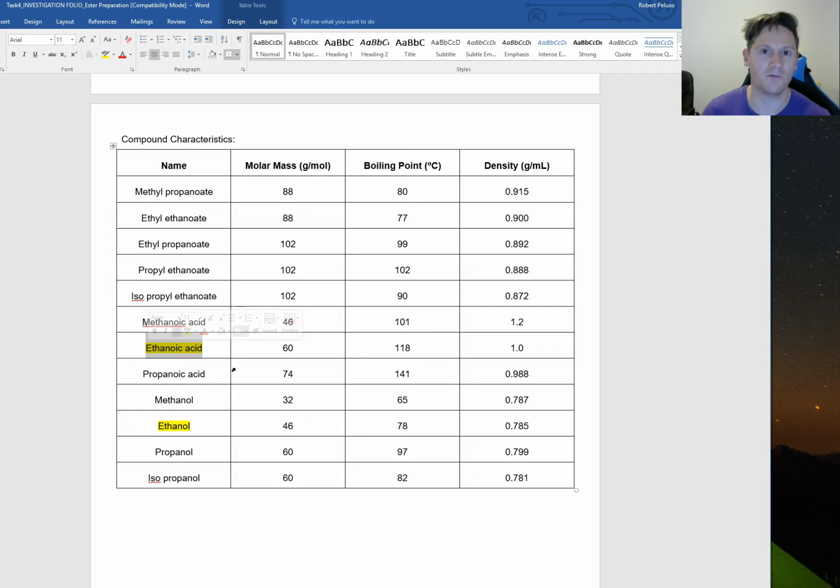So essentially, we're assuming that it's 100% concentrated, which probably isn't the case. There'll be a few impurities there, but that's an assumption that we're going to make when we're calculating the concentration. So that's something already that we can talk about in regards to systematic error. So what we're going to do is work with the density. It's really easy, because it's 1 gram per mil.